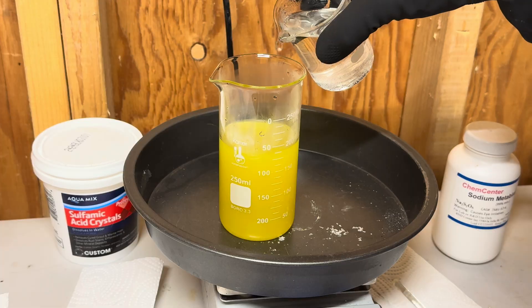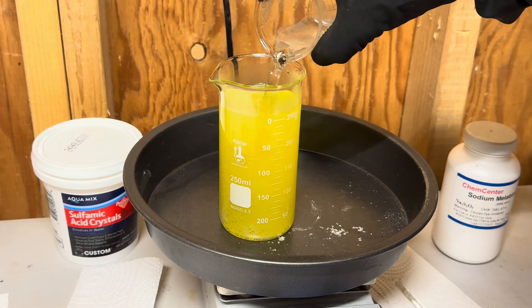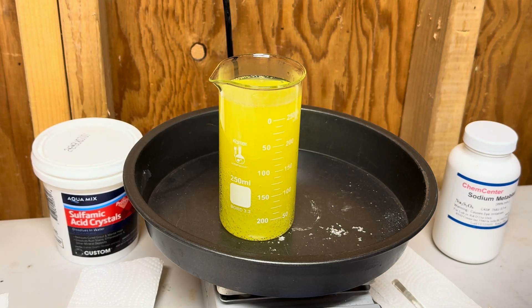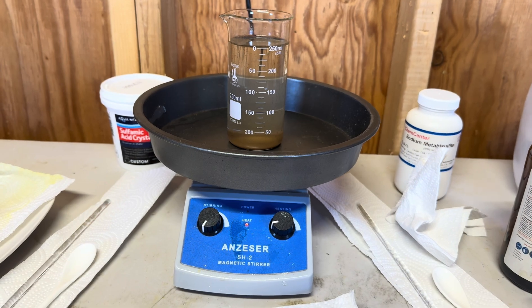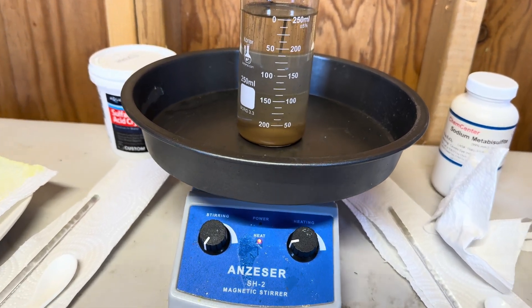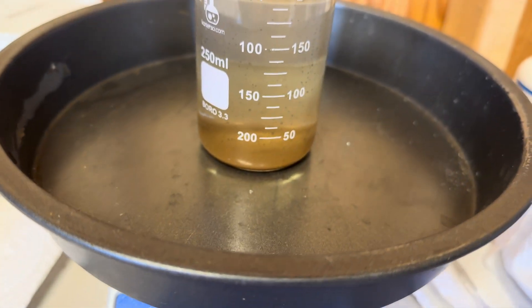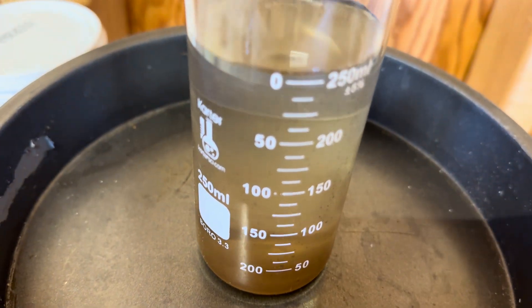Now we will drop our Gold Canyon gold with some SMB. I noticed that my beaker is pretty full, and I did break a 500 milliliter beaker before I started this project, but I have three 500 milliliter beakers on order right now. It is now the following day — our solution has sat overnight, and this is the Gold Canyon gold that has dropped overnight.